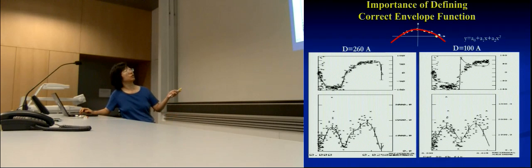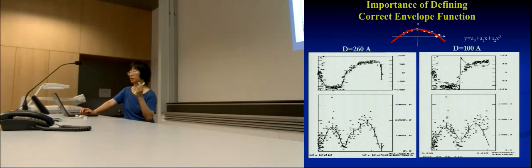So in terms of LATLINEK 50, that means that you need to choose the correct size of the envelope. If you look at your data, it's scattered like this, you use the correct size of your envelope, then it's going to follow the curve. If you use something that's much smaller, you will find the curve doesn't actually fit your data properly.